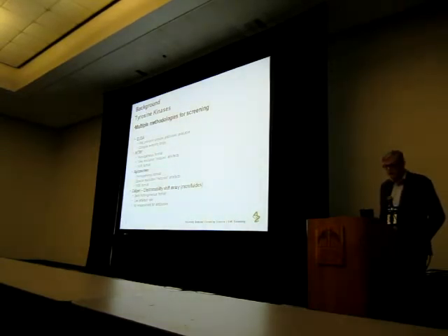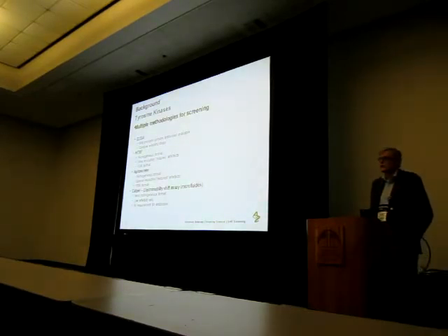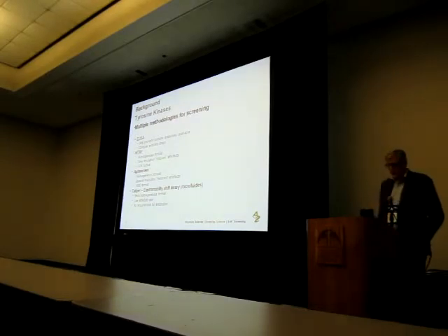So we then progressed to look at assays in the more homogeneous formats, HTRF, alpha screen, and of course they're great because you can work with them in 1536 formats, so you get the throughput that you need. However, one of the problems is that they're pretty much stopped assays, so they're great for an HTS and they're great for doing IC50 follow-up work, but if you want to do kinetics, then that could be a real problem for you. As Pierre kind of alluded to in his talk before I started, there are some issues.